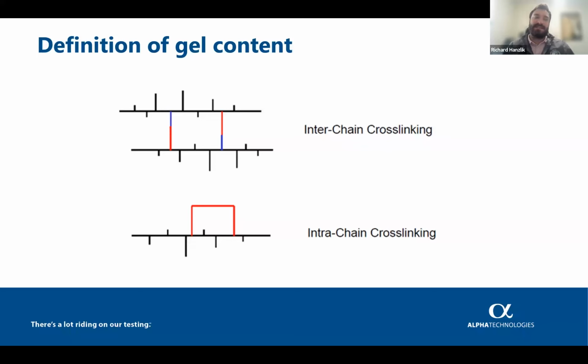The other method that's commonly used for detecting gel is to cut very thin strips of the material and then use an optical microscope to look for granules of gel present in the material. And this method is very subjective. It can change operator to operator. It's very difficult to create those samples. It's a time consuming and manual process. So if we could eliminate both of those methods with, like I said, a quick 10-minute test that just requires a 5-gram sample placed on a die, I think that would be preferable.